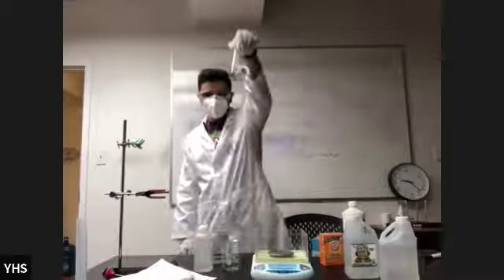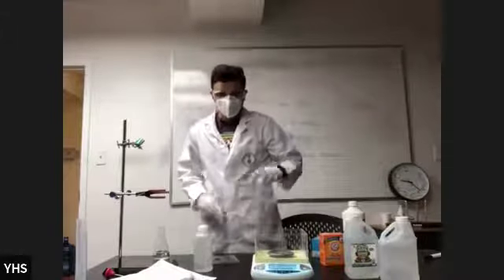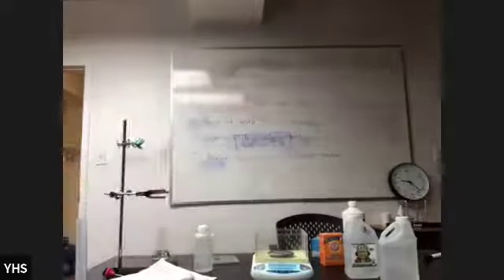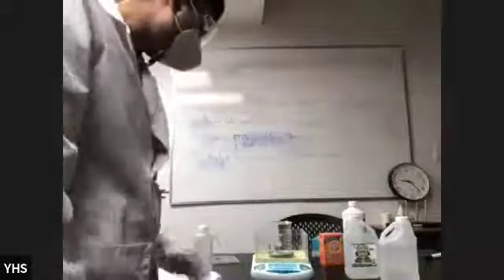I have this, right? Okay. I'll leave it on the side. Next step, I need to measure my baking soda. Good? Okay. All right, let's measure this thing right here. This one right now, just the beaker itself. So right here, not mass of the solid, mass of the empty container is 115 grams.